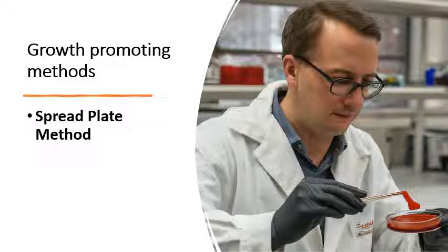So the final dilution is now taken and added to the surface of the agar and spread with a glass spreader. This method is usually used for fungi, call it fungal carpeted growths, and also used for bacteria, but it's most good for fungi, and incubated. The same procedure for incubation, then enumeration.